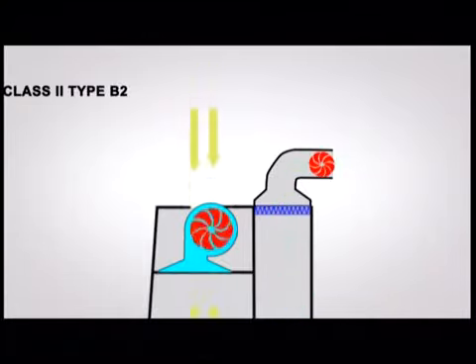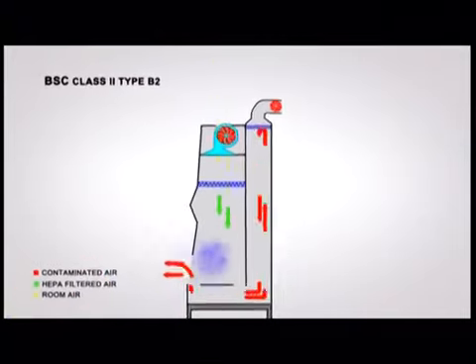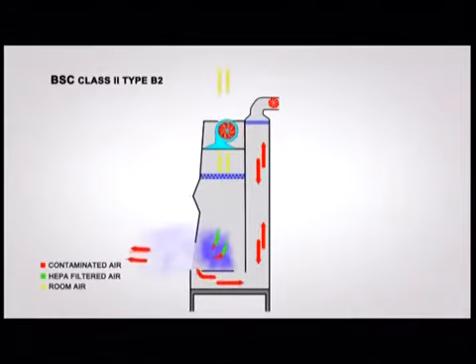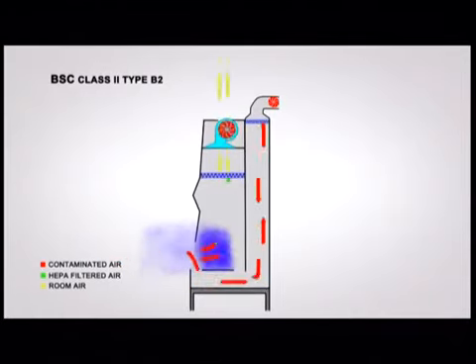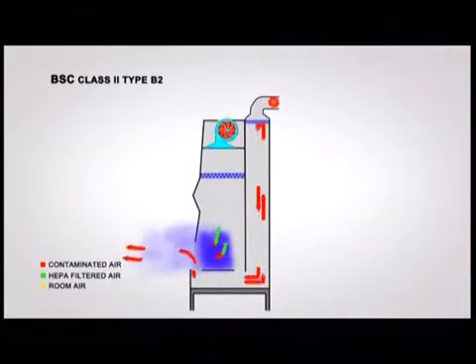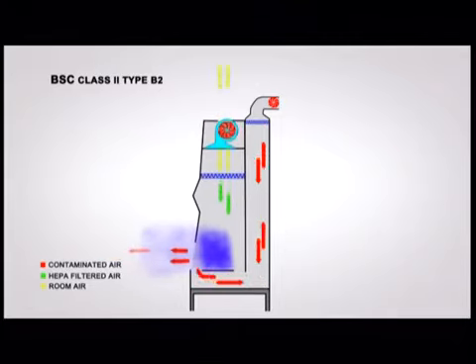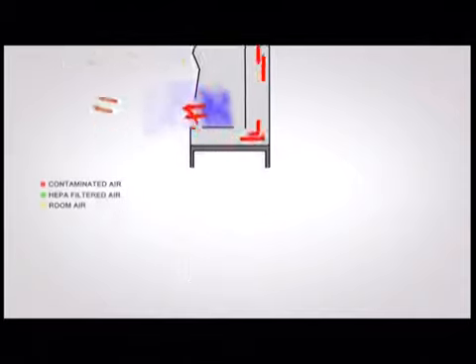This is accomplished by installing an exhaust monitor in the duct above the BSC and electronically interlocking the BSC fan via a relay. By doing so, it will ensure that if there is not sufficient exhaust, the BSC fan will shut down and not push any contaminated materials out through the work access opening.